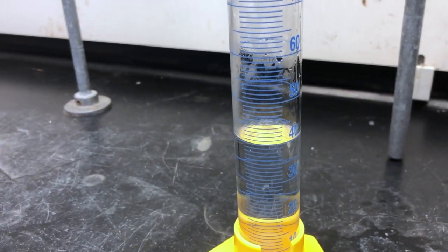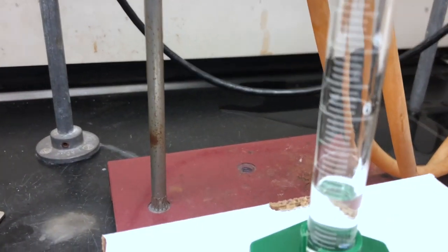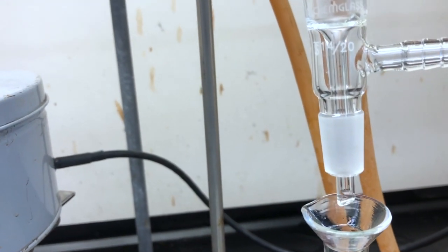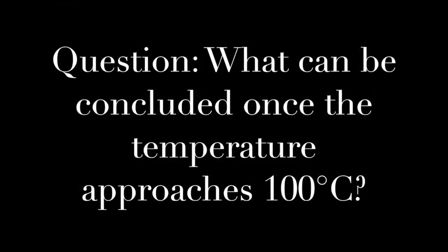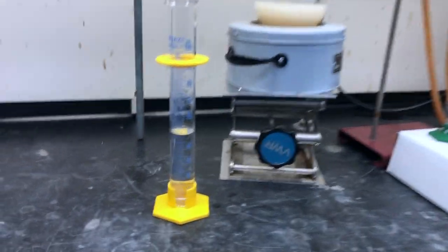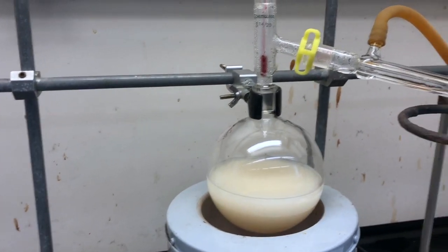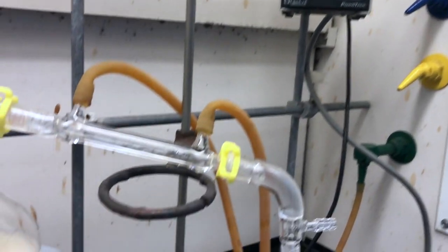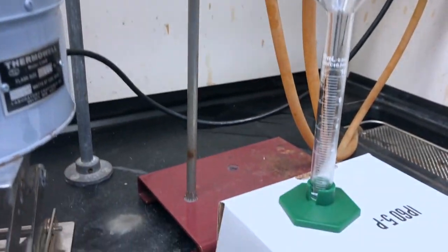It's rolling rather rapidly now. You can see that the appearance of the vapor is quite a bit different now that the temperature is over 95. We're getting close to the 50 mLs collected on our last 10 mLs. Even so, the drop rate has not changed that much. Once we reach 50 mLs, we can turn off the heat and lower the lab jack down to remove the heat from the large boiling flask. We will discard any further liquid that collects in the graduated cylinder at this point.